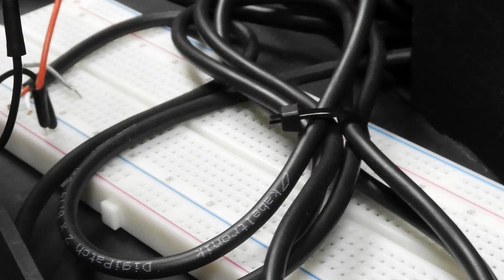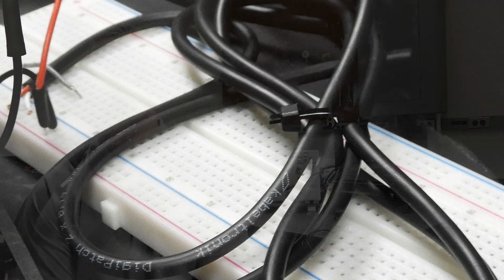In terms of electrical safety, all wires have been grouted and fed through a hole within the enclosure and set within the box below the GUI. With all electrical and mechanical standards met, the user is required to have the proper training in handling microparticles and blood to reduce extraneous risks.